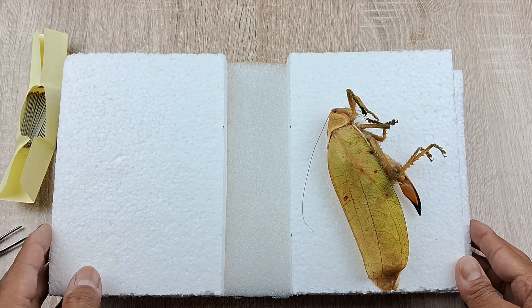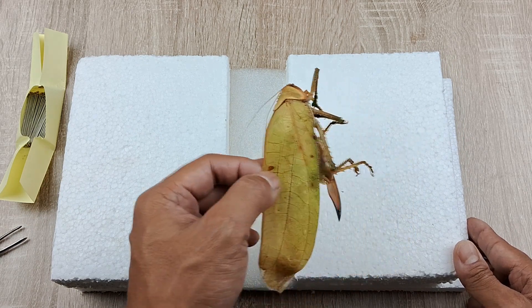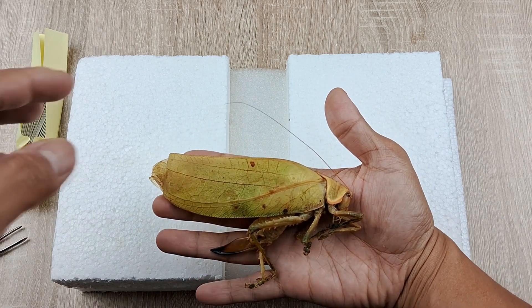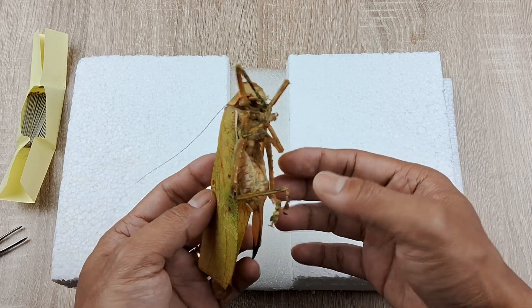This leaf katydid was euthanized with ethyl acetate after collection and had been in the freezer for a good 8 to 9 months, the main reason being I never had the time to process it. The specimen had been defrosted prior to shooting this video. As you can see, it's still in pretty good shape considering.